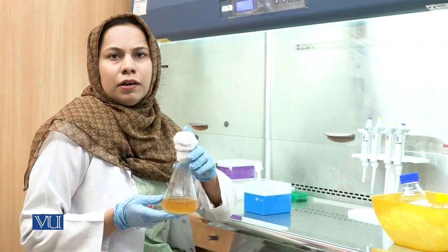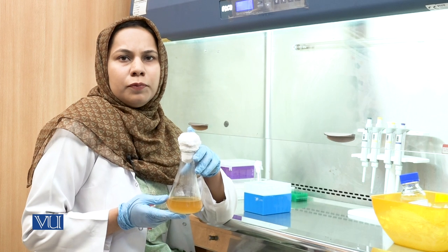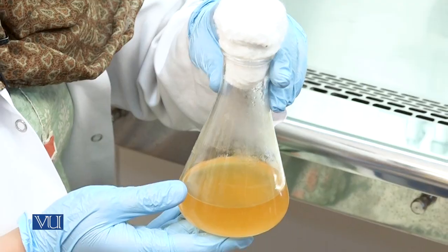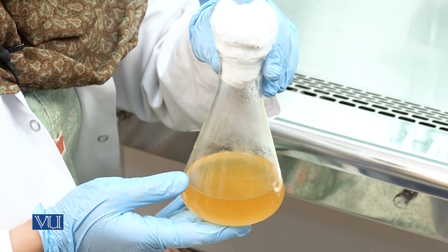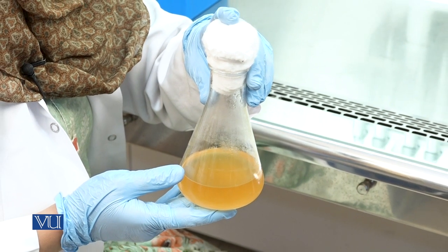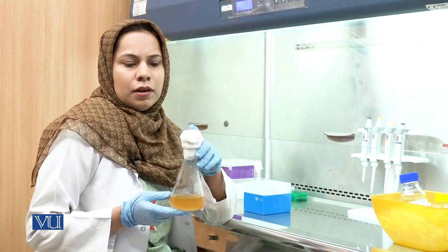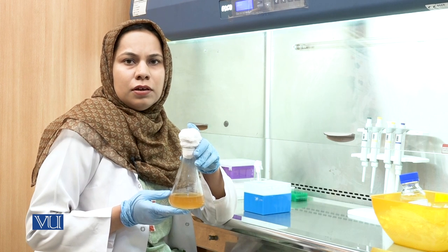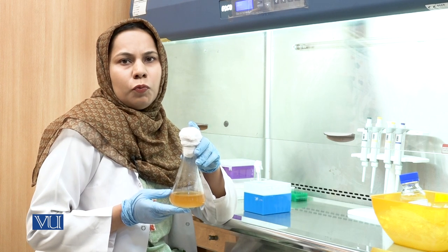Now we have inoculated 100 ml of LB broth with 0.1 ml of overnight grown E. coli culture. We need this culture to be put on shaker incubator at 37 degrees centigrade for about 2 hours. And after 2 hours, we need to check its optical density so that it reaches about 0.5 to 0.7. When the OD reaches about 0.5, and the cells start growing, we need to pellet down the culture.